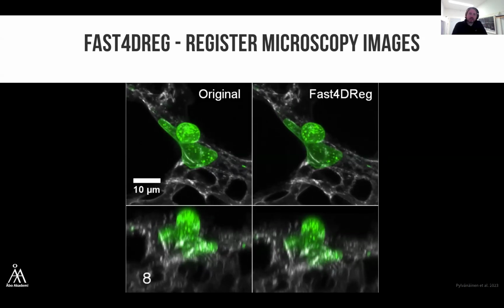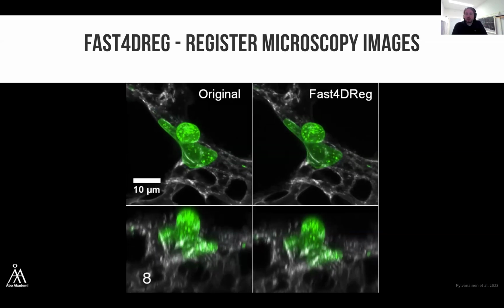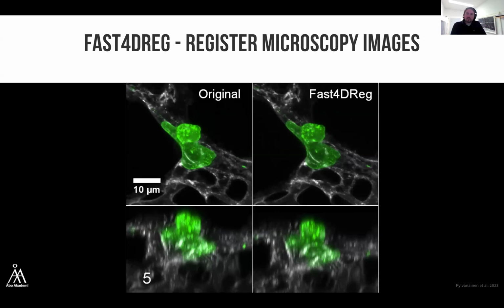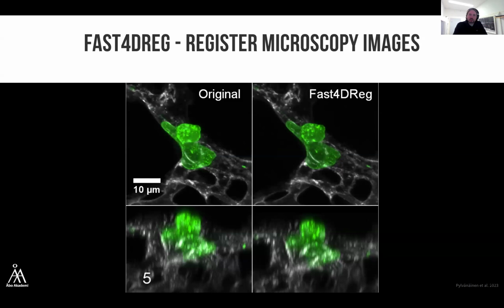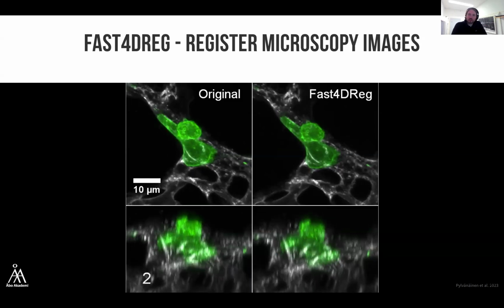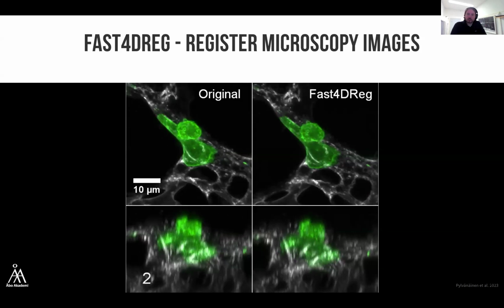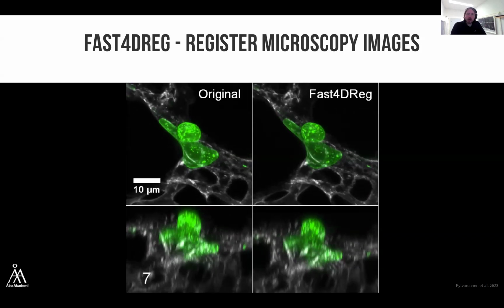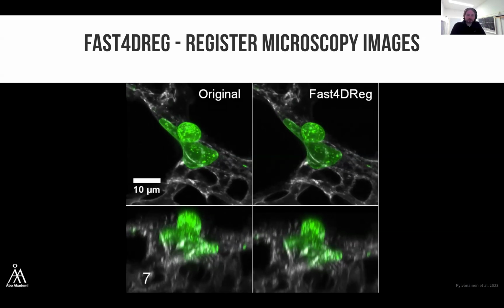So here what you're looking at are pancreatic cancer cells inside of the vasculature of a mouse. We've injected the cancer cells in the tail vein and dissected the mouse as soon as possible after the injection. We took the lung fresh, sliced it, and imaged it straight under the microscope to try to understand how the cancer cells are interacting with the live vasculature ex vivo.